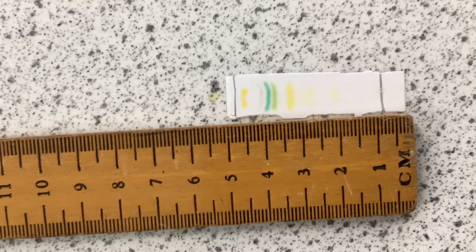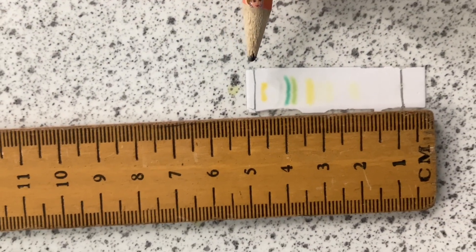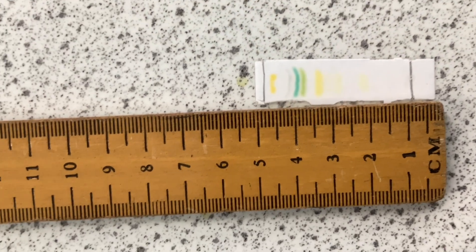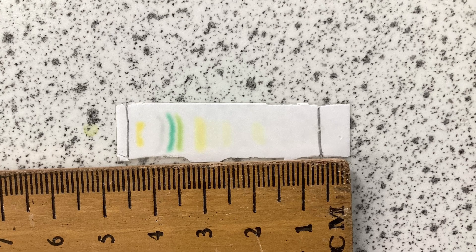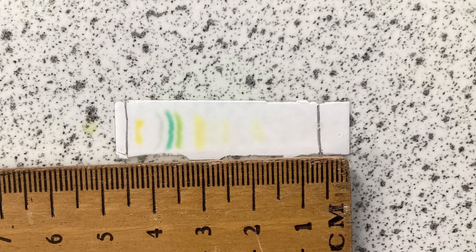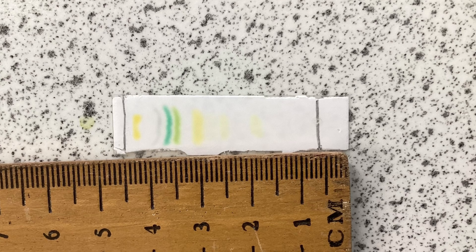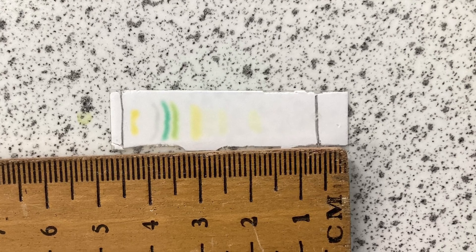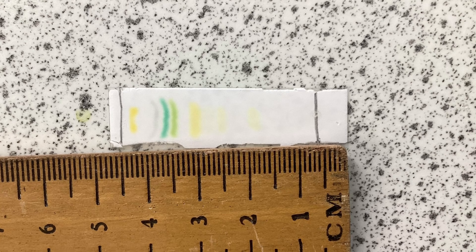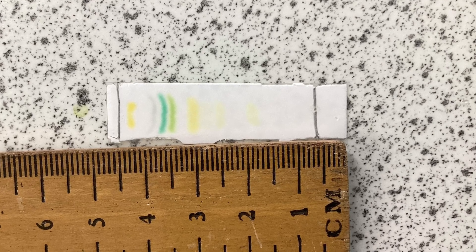As you can see here, I've now drawn with a pencil line the solvent front, and that will help us calculate our RF values. To calculate the RF value, you need to measure the distance from the starting line to each of the individual pigment lines. You then divide each of those values by the distance between the starting line and the solvent front. This will give you an RF value between 0 and 1, and can be used to work out each of the different pigments that you have inside your leaf.